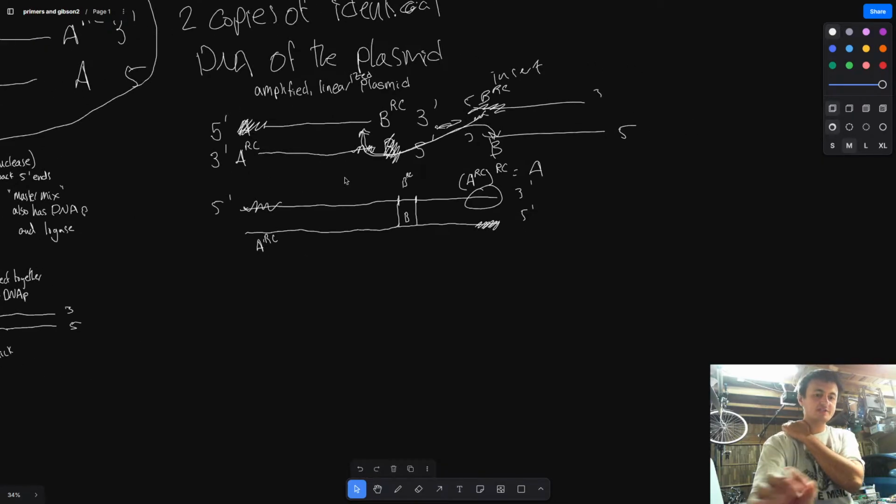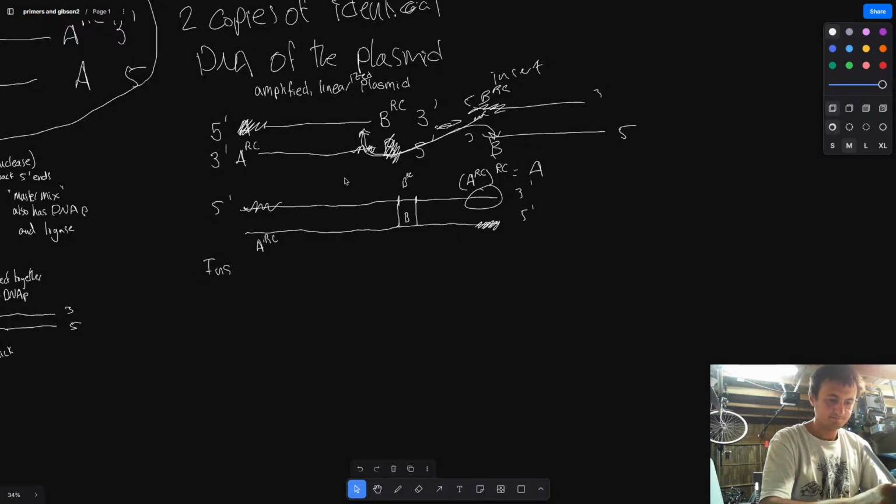Okay, so what is our insert? Our insert sequence is going to be, what are we going to have? We're going to have BRC, because we're going to write it as a 5 prime BRC.